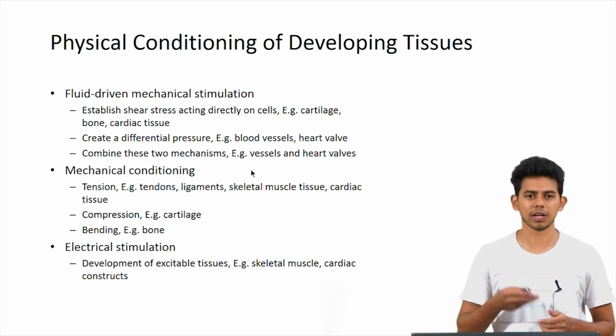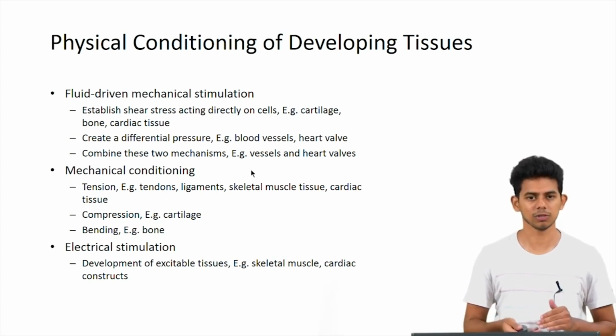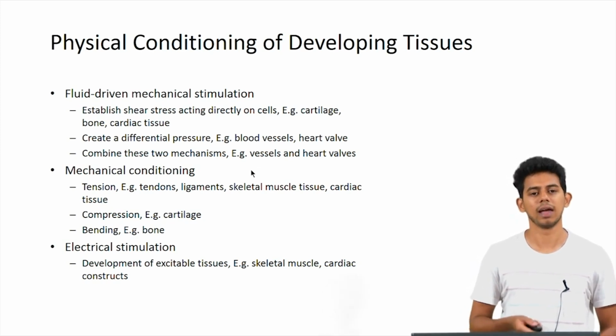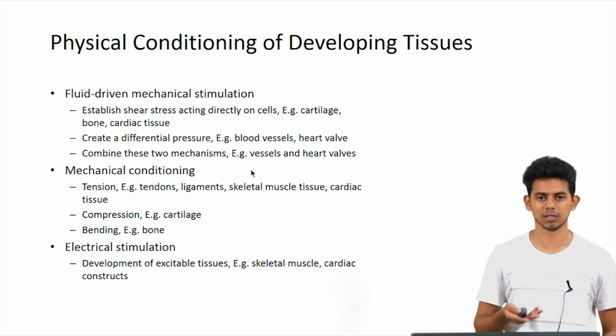So also create a differential pressure. We can even combine these two mechanisms, especially in making vessels and heart valves. The mechanical condition, wherein you give a tension or compression like in bone, cartilage, etc. And electrical stimuli, which is used in cardiac, skeletal and muscle constructs.